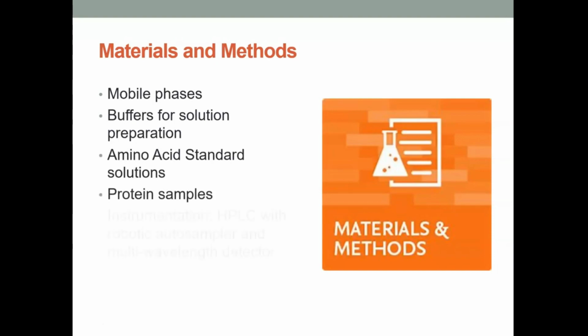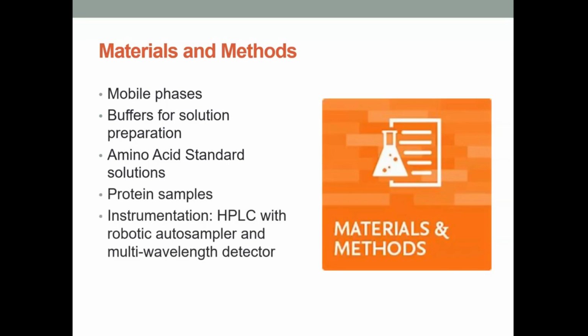Our protein samples for testing. Our instrumentation, our HPLC. We are using a HPLC with a robotic autosampler and a multi-wavelength detector. The method has been pre-formulated before we start.